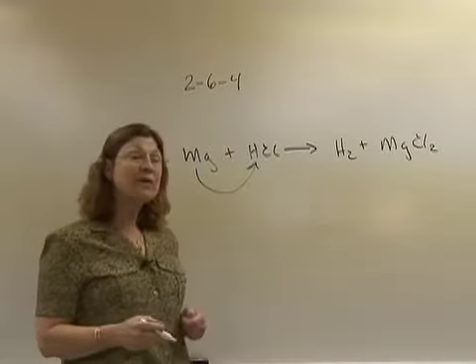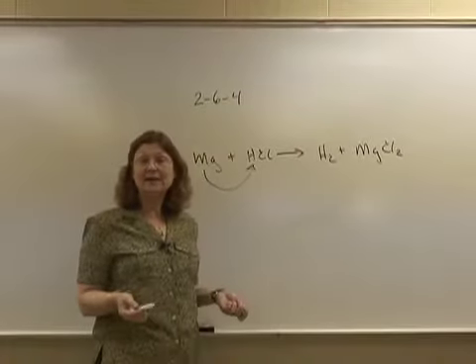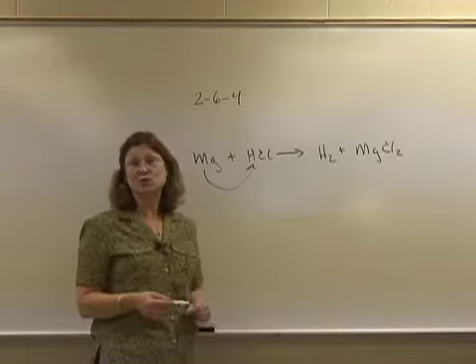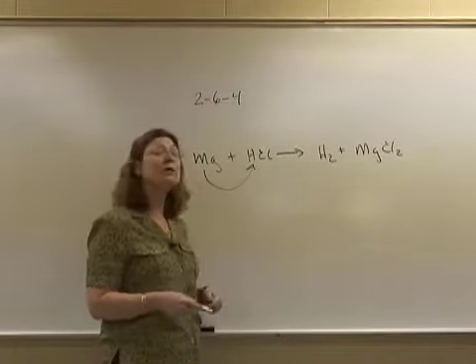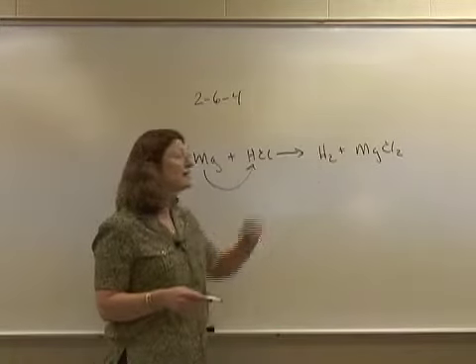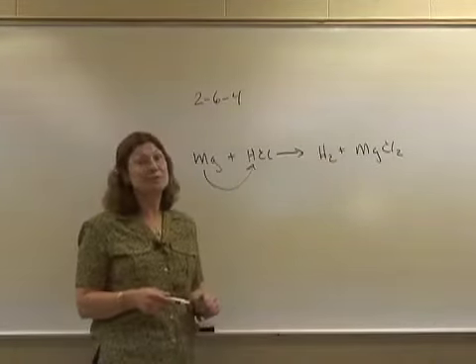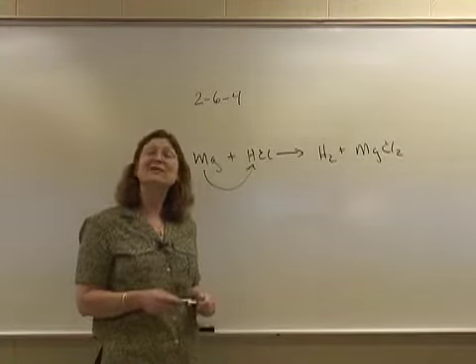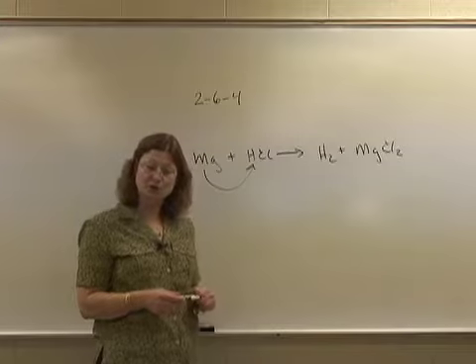Now, we know that the magnesium theoretically should be with a +2 charge and 2 chlorines. However, we want to determine that experimentally. And it's the hydrogen gas that can create problems because it's very flammable, and we'll be using the Bunsen burner. So we need to do that under the hood.